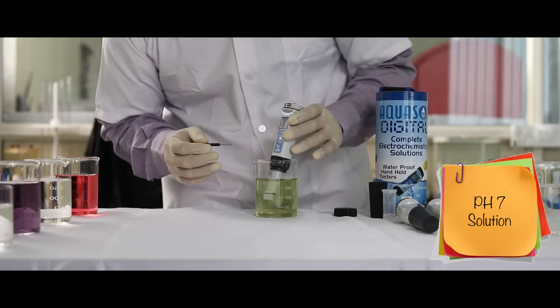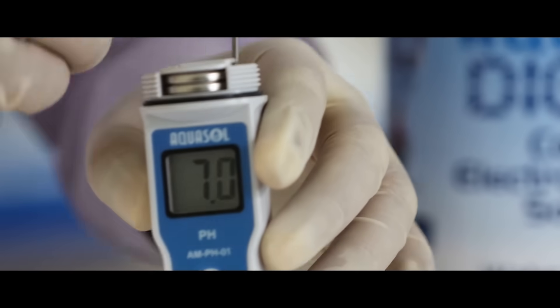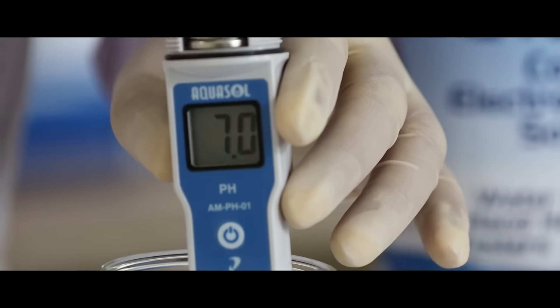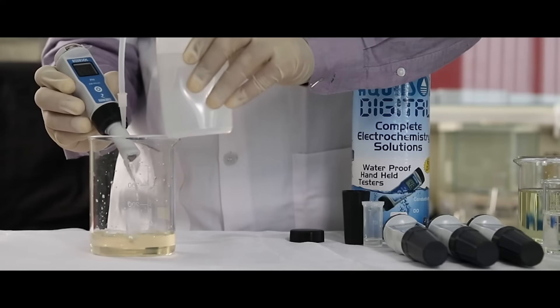Dip the electrode in the standard pH7 buffer solution. Using the zero screw, adjust the pH value on the display to the standard value. Once the value is adjusted, wash the electrode with clean water.